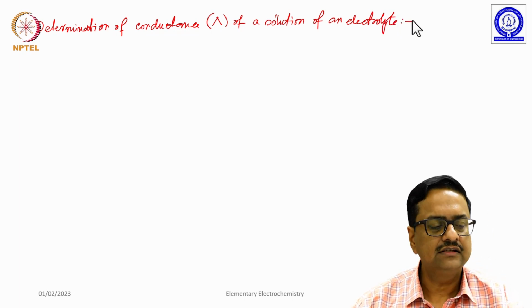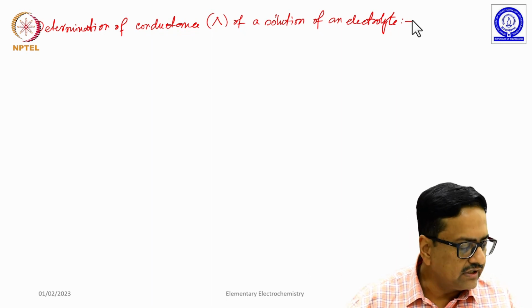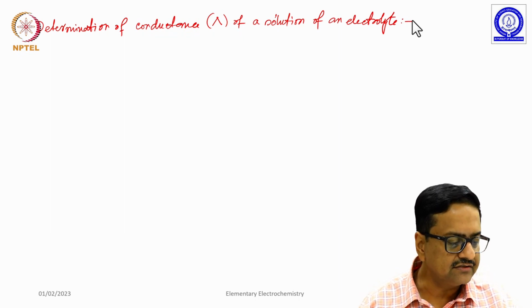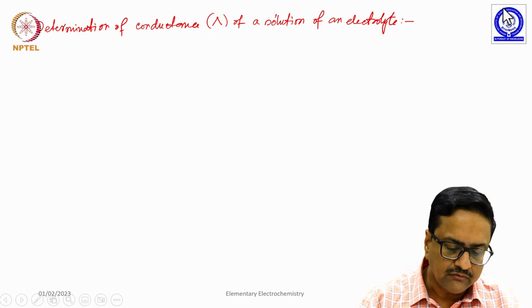So, in this lecture, we will discuss some of the instruments that are used, some methods that are used for determination of conductance.